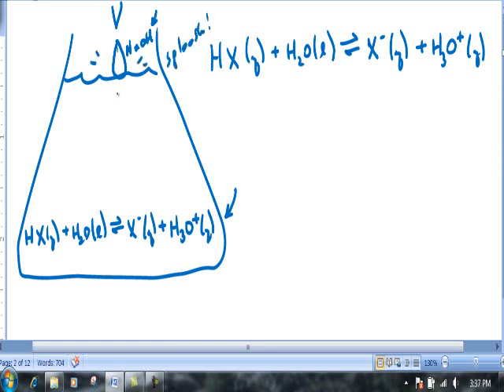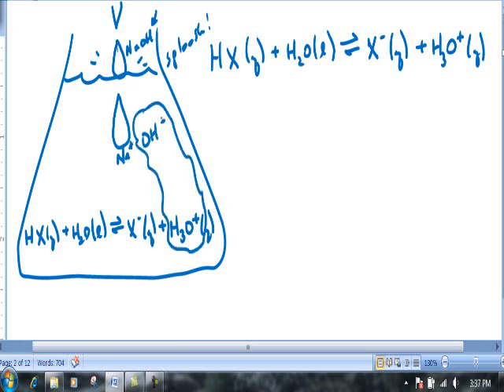As the sodium hydroxide drop goes into the weak acid solution, we place into the solution aqueous sodium ions and aqueous hydroxide ions. The hydroxide ions react with the hydronium ions to create H2O and H2O. What this does is it's neutralizing the acid by eliminating the hydronium ions.